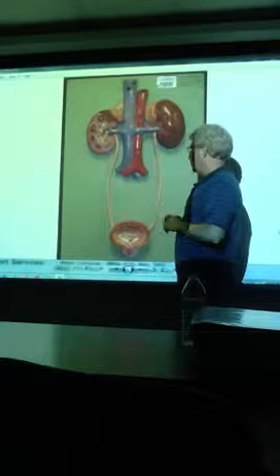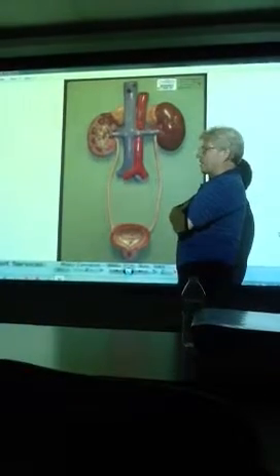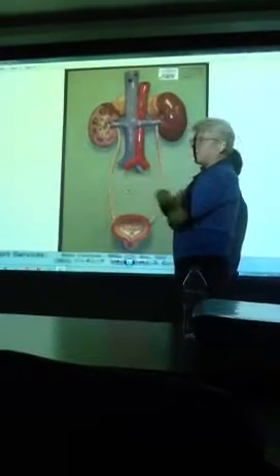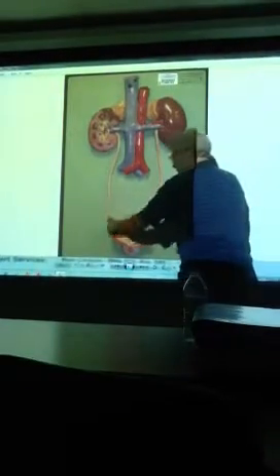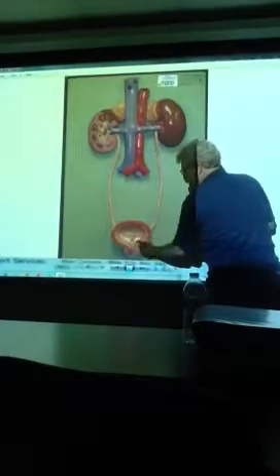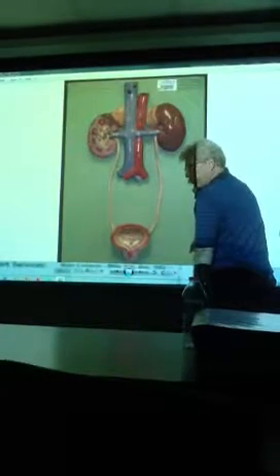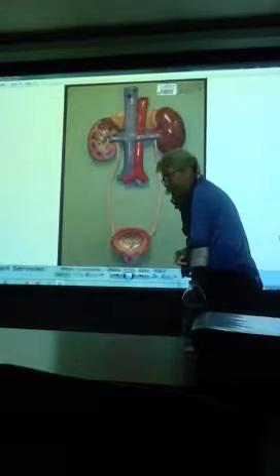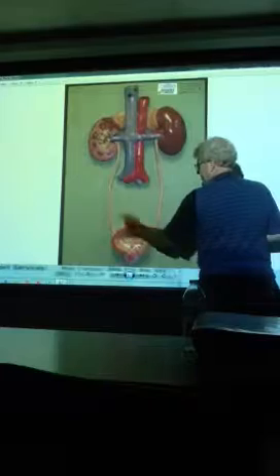What is the renal pelvis made of? Like, is it just soft tissue or something? No, it's probably kind of a connective tissue. It probably has the same kind of adventitia and stuff like this does. Alright, so we come down. There's your trigone, urethra. Is this a guy or a girl? Girl. Try again. That's a guy's prostate right there. Girls don't have it.